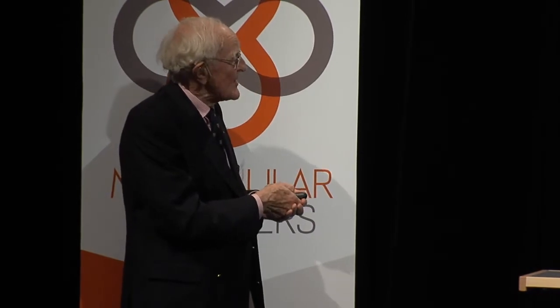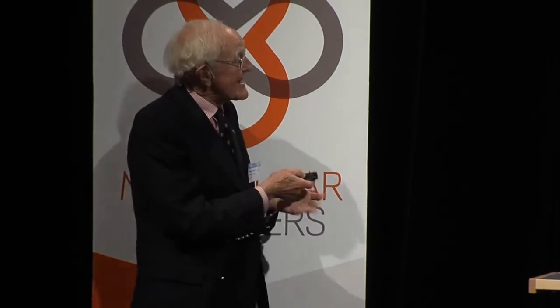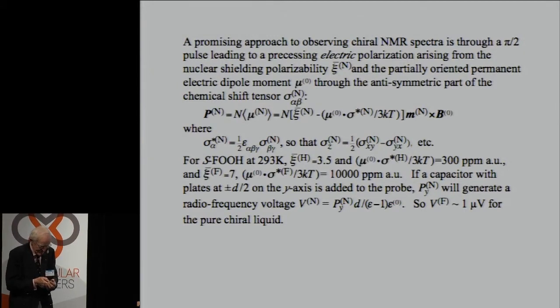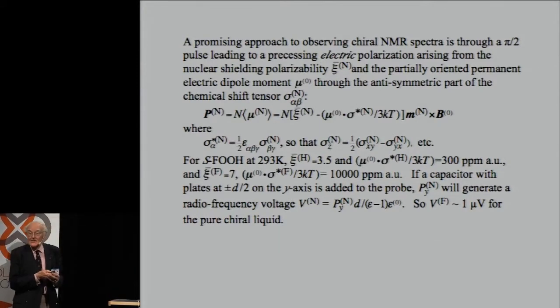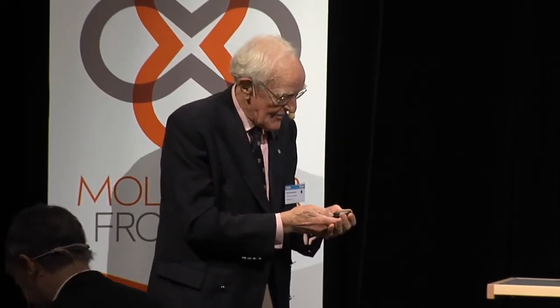So how big is the voltage you'd expect on a simple capacitor? Well, it's of the order of a microvolt, which is very hopeful indeed. But what about experiments? Well, I've retired for some years now, but I'm still collaborating with friends and colleagues. And in the French High Magnetic Fields Laboratory, we are setting up an experiment.